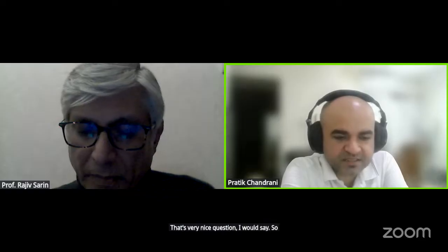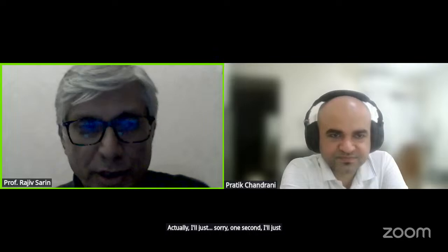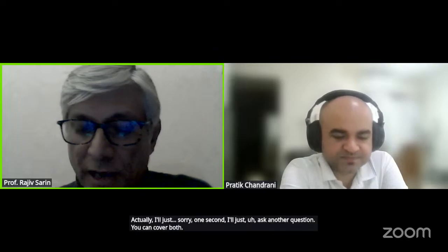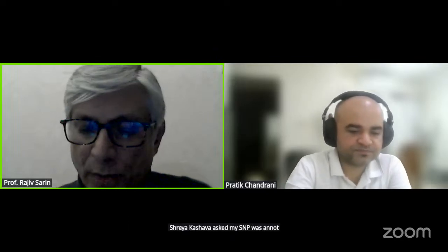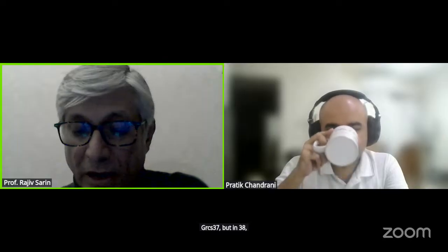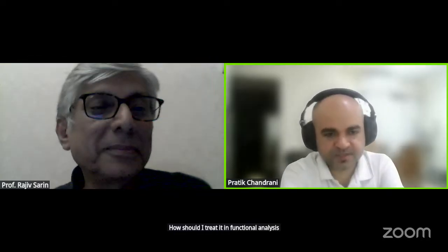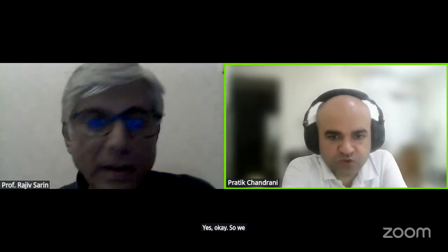Actually, sorry, one second. I'll just ask another question, and you can cover both. Shreya Kashyap asked: my SNP was annotated as a promoter variant in dbSNP GRCh37, but in 38, it's intronic. Since literature supports a promoter role, how should I treat it in functional analysis? Okay. So we'll go through both.